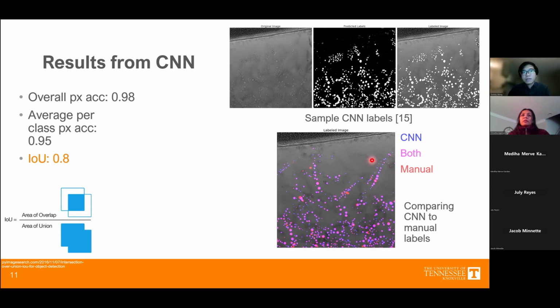So can you comment something on the precision and recall? Precision is true positive divided by true positive plus false positive. Recall is true positive divided by true positive plus false negative. So what do you understand by these two terms, and in your code, what were the precision and recall values?